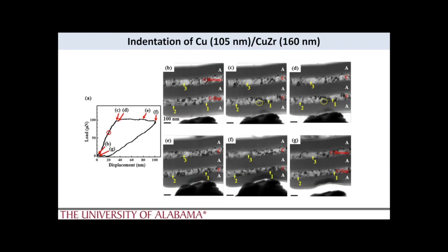Does that mean that the grain has been consumed? Is it just not in the right diffraction contrast? All these things can be sorted out through the upcoming PED data. We can now see that grain number 1, which was in a weakly contrasting condition, is now strongly diffracting. And then we can see, for example, grain 2, which is pretty invariant through the entire process, really doesn't change its contrast very much. So we have this great diversity of responses that we have to decipher through our TEM images.